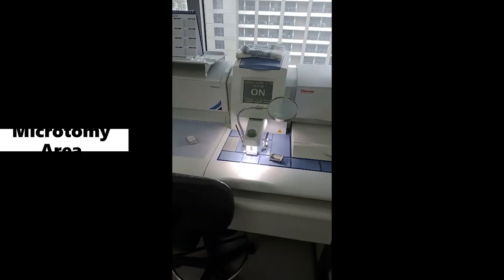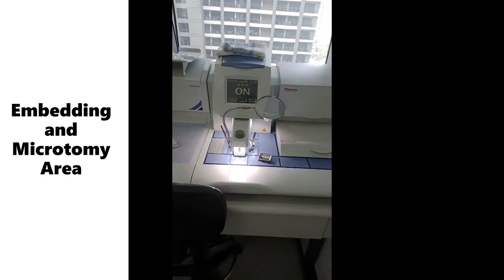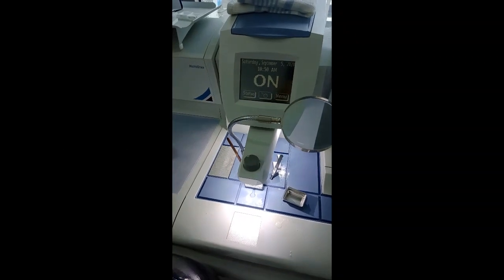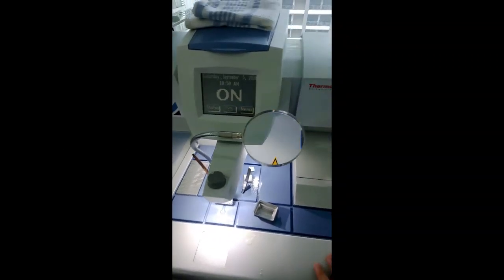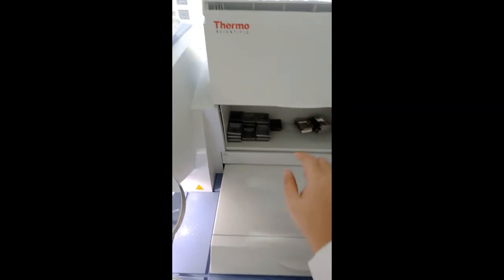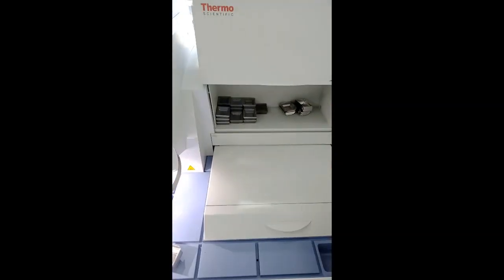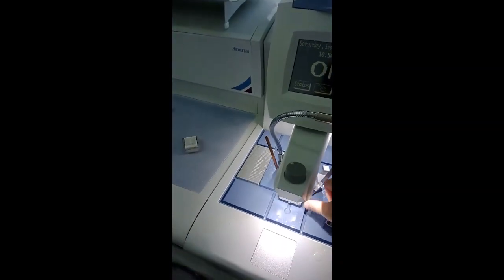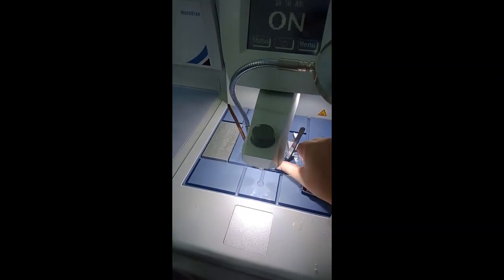The next morning, after the tissue cassettes are done with the processor, we usually go through the embedding process. With the embedding process, we have different types of molds. Depending on the size of the tissue, we use a different variety. After that, we place the tissue cassette inside the mold and then fill it with molten paraffin.